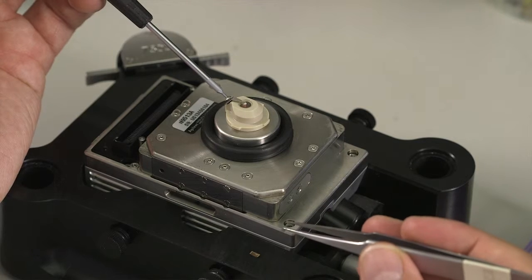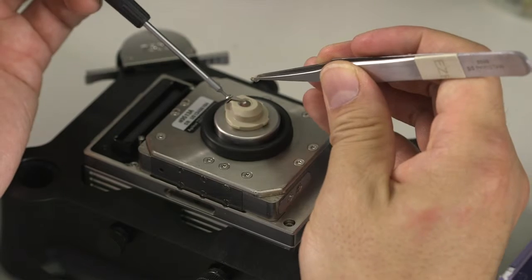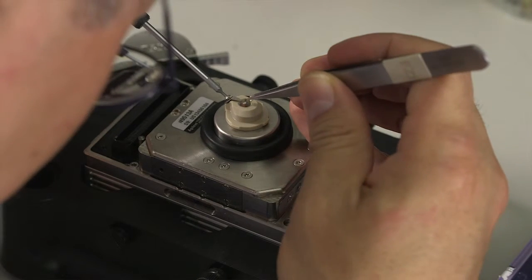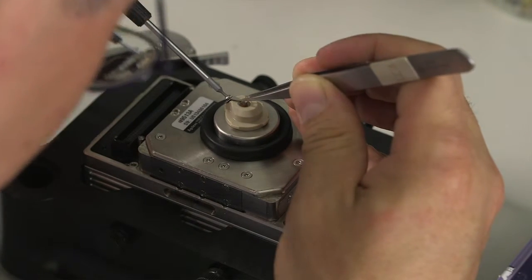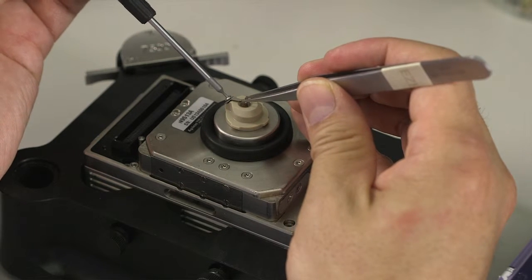At the same time, pick up your cantilever using the tweezers and insert it underneath the spring, and then gently tighten the spring using the screw.